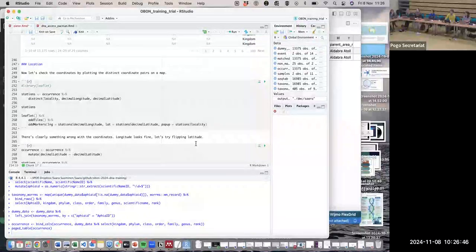And within the QIIME ecosystem, there's also a way of creating a new tool within QIIME as well. So that's another option. Why don't we just link to those existing tools?